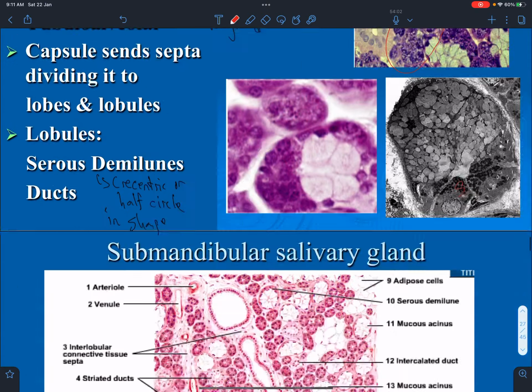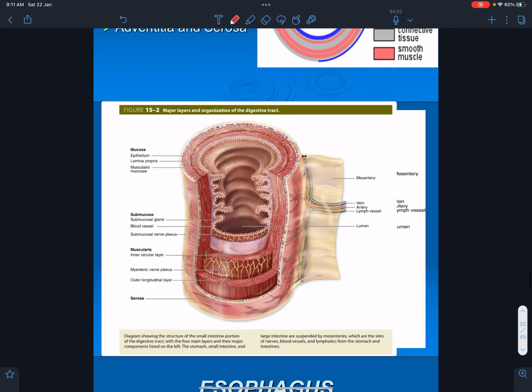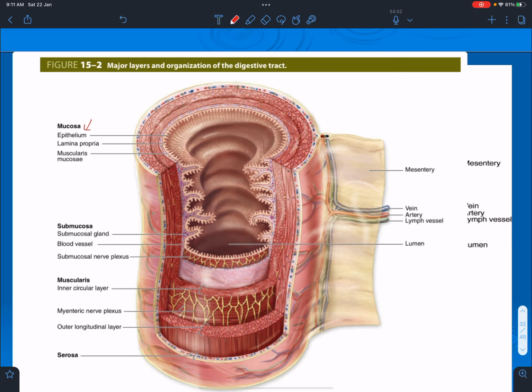So if we go to the esophagus, that's the difference immediately from your esophagus to, let's say, your stomach and intestine, is that they're lined by an epithelium that is not found in the stomach. Because in the stomach and intestine, we're going to see they're lined by simple columnar epithelium, for instance. So that's immediately for the esophagus, which is divided into 4 layers. We said the mucosa is lined by what epithelium? Non-keratinized stratified squamous epithelium. And the mucosa, meaning epithelium, has a lamina propria underneath.